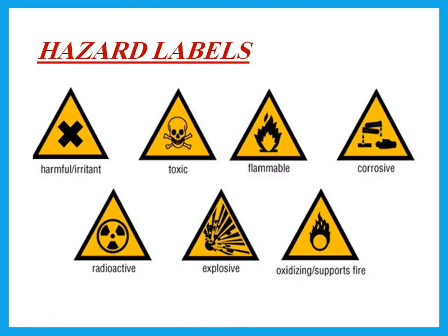Hazard labels do not come very often, but notice the label for toxic — you would see that skull symbol on a bottle of chlorine gas, for example, because chlorine gas is toxic. The label for corrosive you will see on an acid or a base.